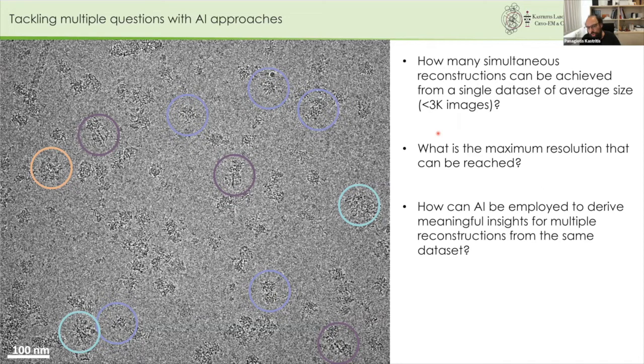What I showed you is reconstructions and a bit of structures from cell extracts, but only of one molecule, the one on the bottom here. But the idea is to move towards simultaneous characterization of these protein communities and their members, how they look, and how we can use artificial intelligence for that.